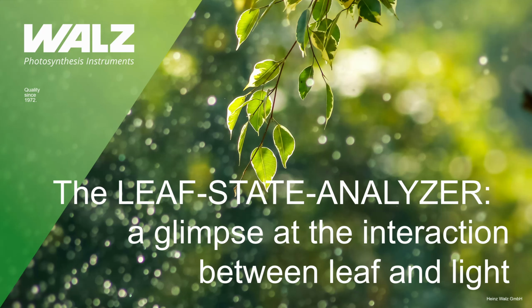In the coming presentation, I want to introduce a Walz instrument, the Leaf State Analyzer. At the same time, I want to talk about the processes that can be measured with it and, as well, the interrelationship between the measured parameters and photosynthesis.